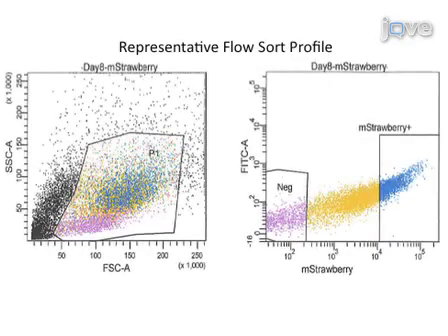Previously published ES OP9 co-culture protocols have focused solely on the passage and evaluation of the non-adherent floating cells. In this modified protocol, all ES-derived cells, both adherent and non-adherent cells, are passaged and can be evaluated. This leads to increased yields of hematopoietic cells, allows for the identification of rare populations of cells, and provides for complete characterization of all ES progeny, both hematopoietic and non-hematopoietic.